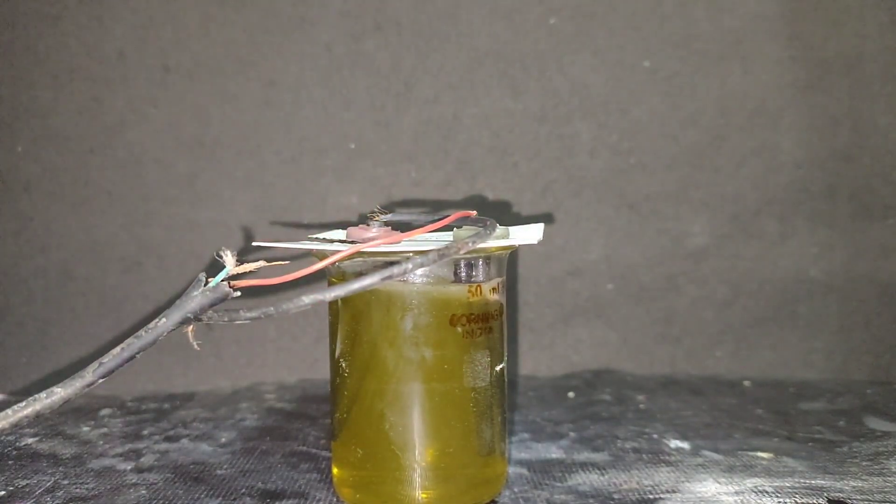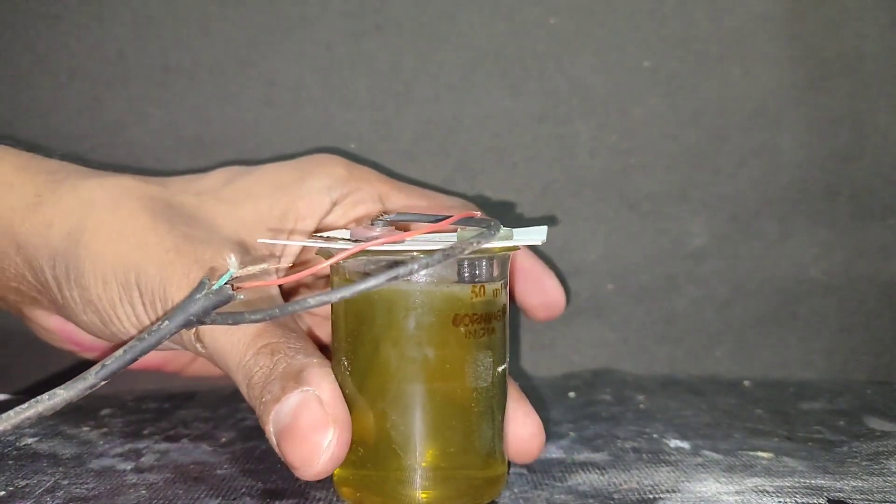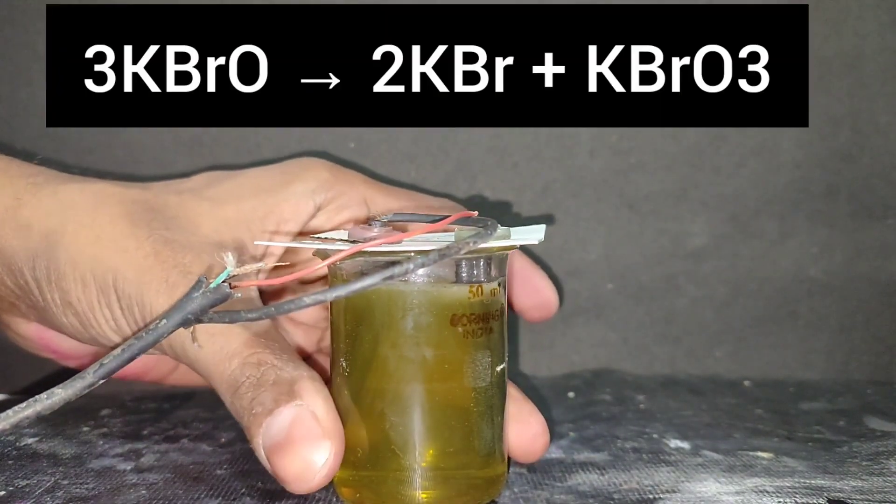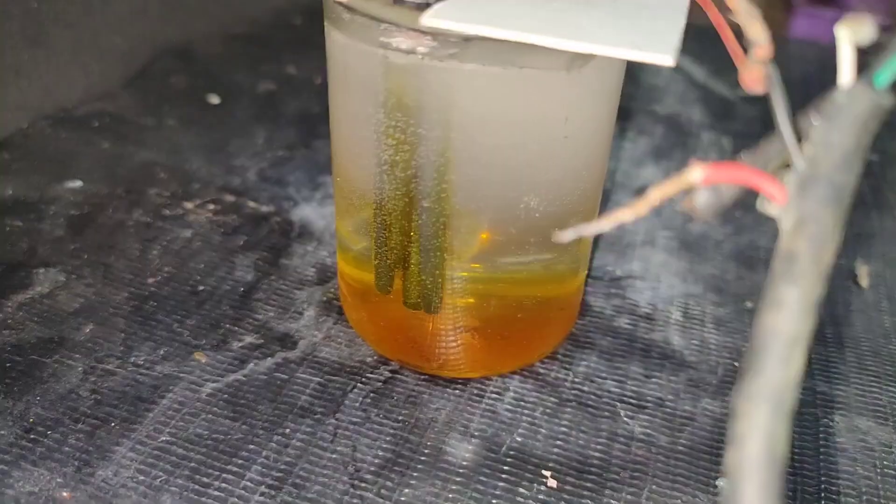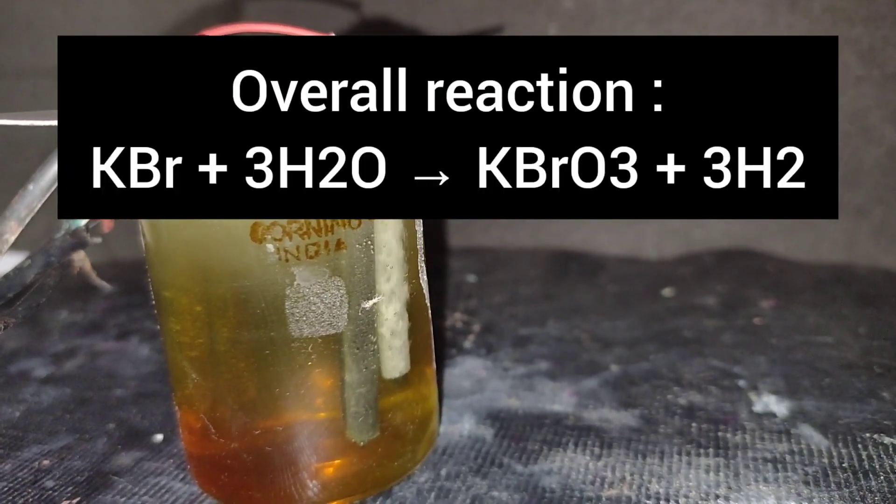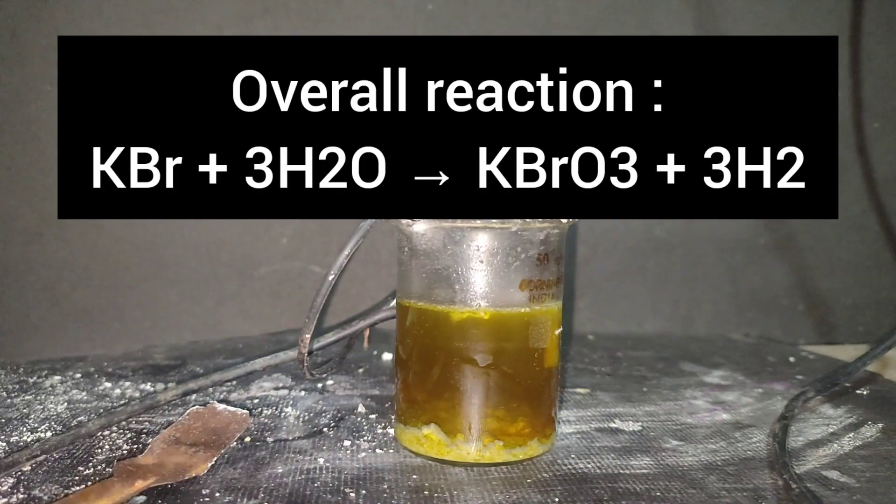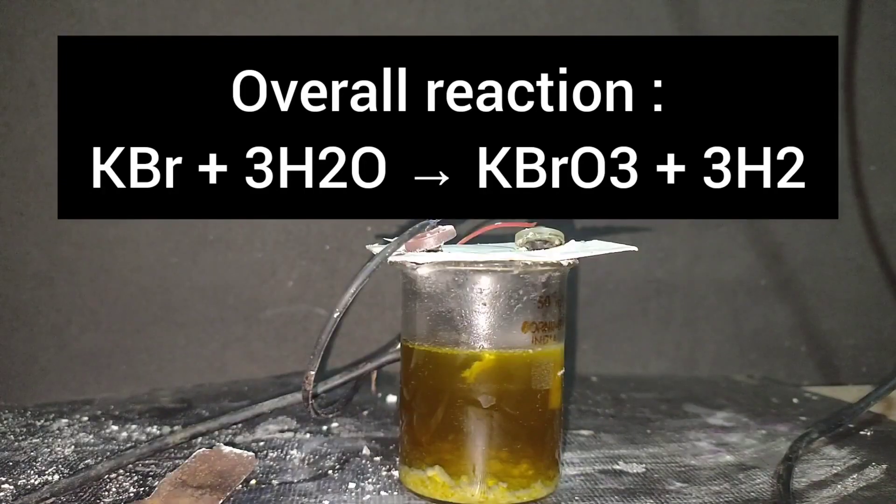Now as the concentration of potassium hypobromide will increase, the potassium hypobromide will disproportionate into potassium bromide and potassium bromate. And due to lower solubility of potassium bromate in cold water, the potassium bromate will settle in the bottom of the solution.